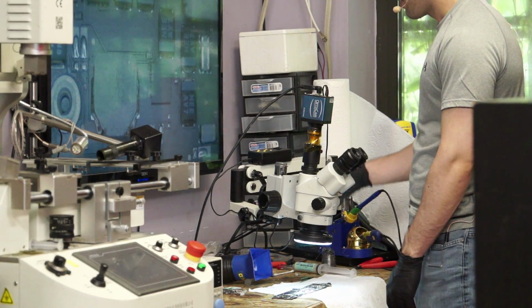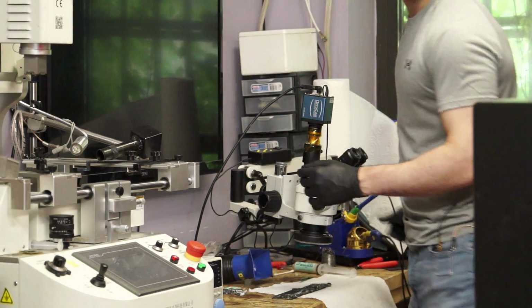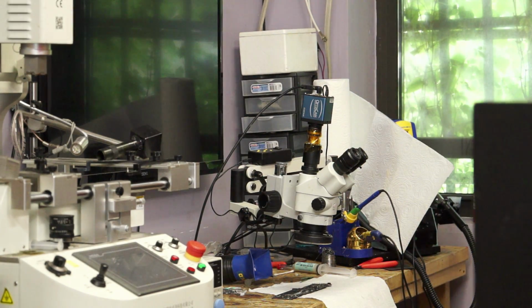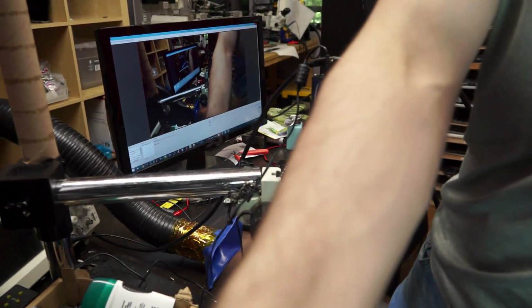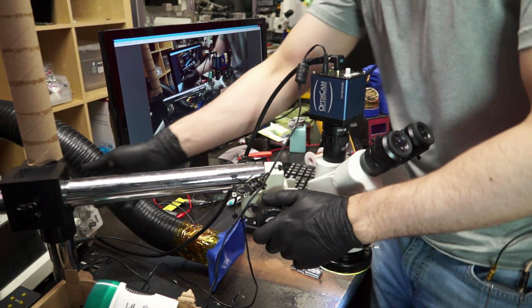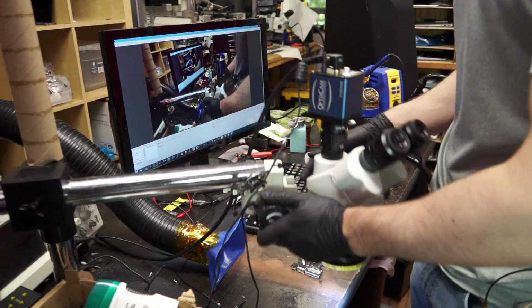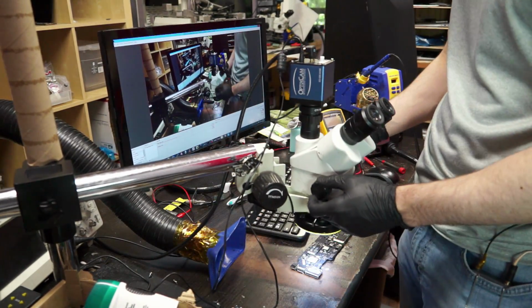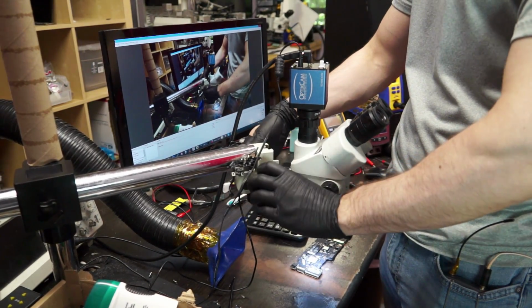And here's the thing that I find. I cannot set this microscope up so that it is more sturdy, but I can set up the boom stand microscope so that it is more flexible. So the reason that I prefer this one is I can make this thing more flexible. It's a boom stand, but if I want to make it more flexible, I can simply have this thing up here and unscrew this thing over here, and I can just move it around as I see fit. And this is enough up and down for me. I don't need more up and down than this.